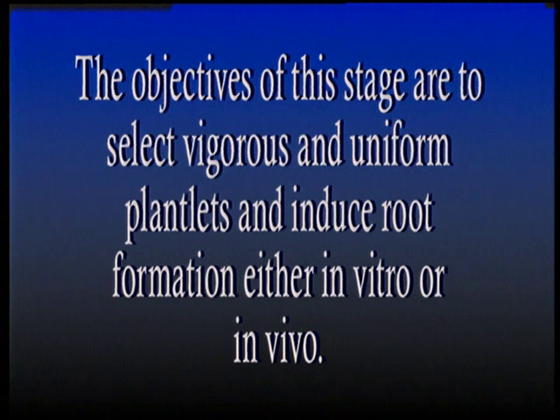So, to summarize, the objectives of this stage are to select vigorous and uniform plantlets and induce root formation either in vitro or in vivo.